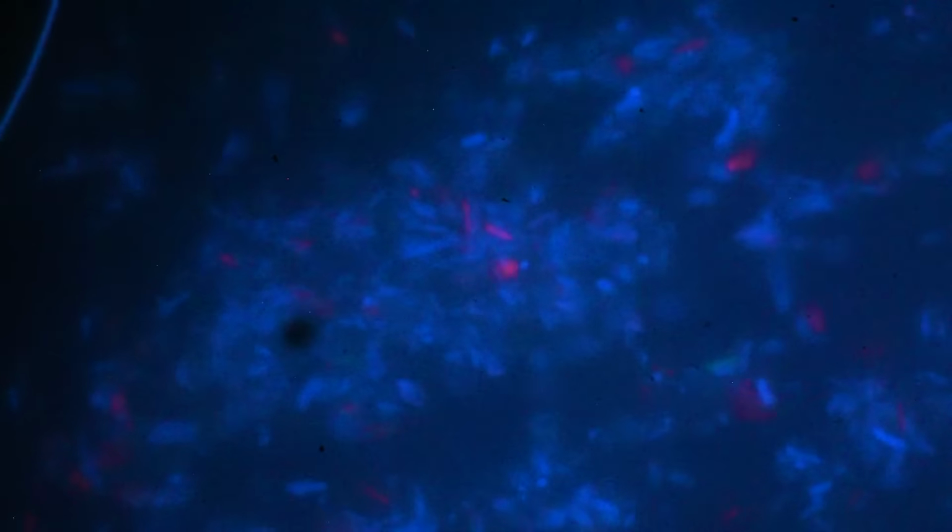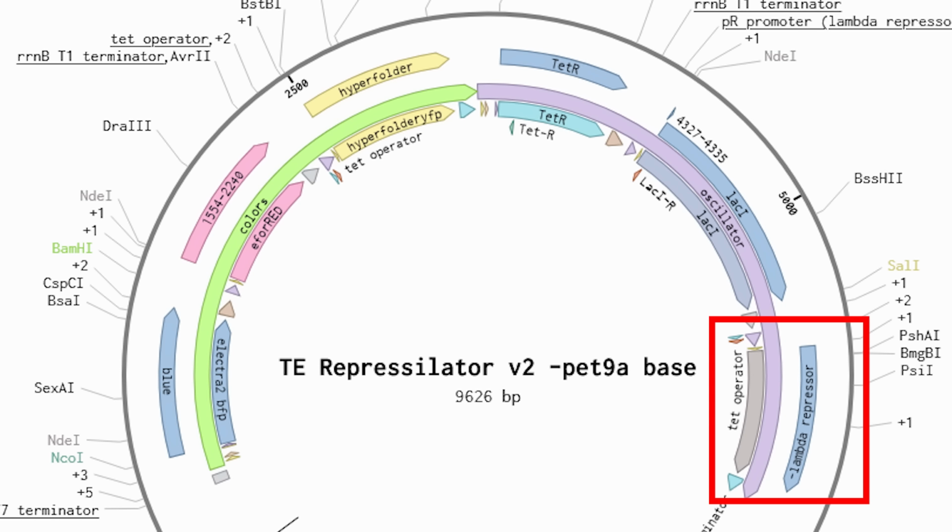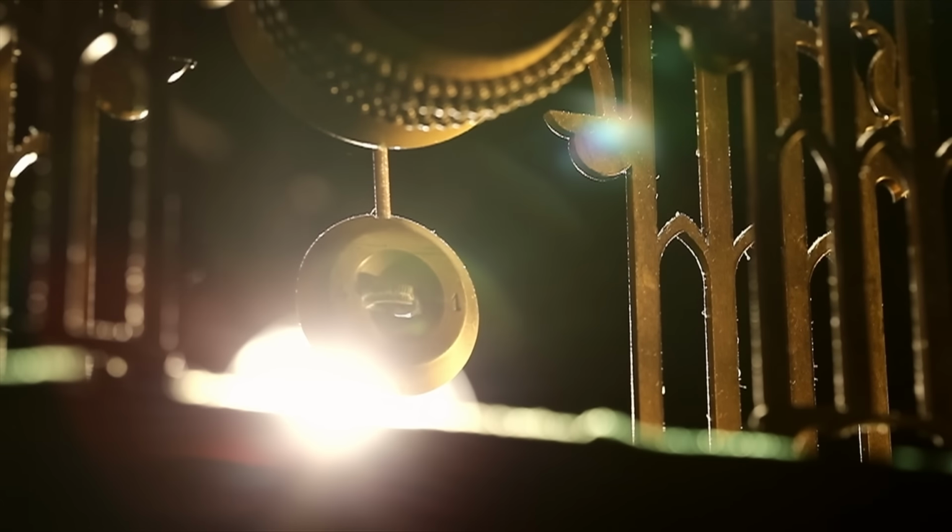In the lactose version, we see lots and lots of red cells, some blue and some green. And in TET, we see lots of blue, some red, and some green. Unfortunately, the third repressor isn't triggerable, so I can't make it go mostly green. So the circuit definitely works. I think the tick rate is just really slow.